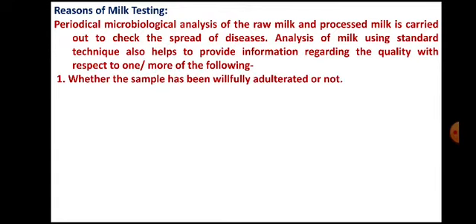Now all these milk testings are done to know the following things: whether the sample has been willfully adulterated or not. So adulteration of milk can be tested.